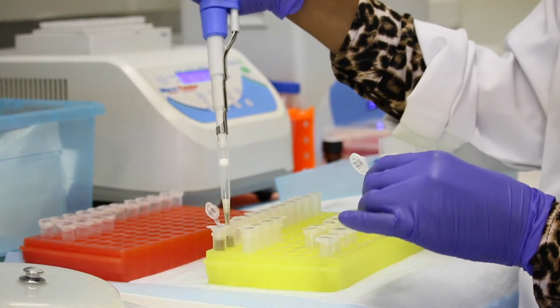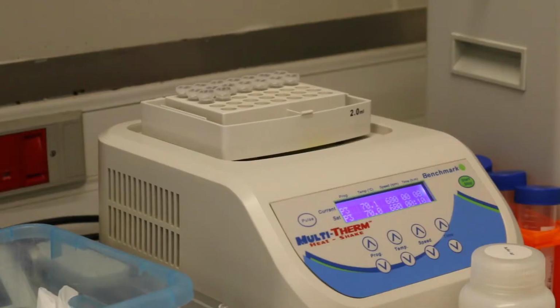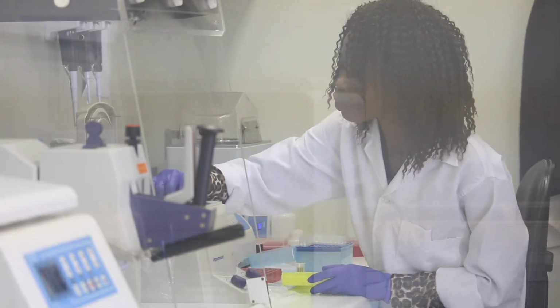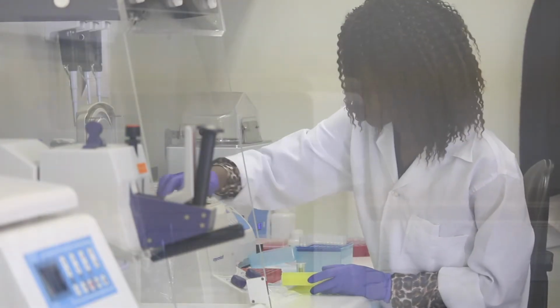We have a laboratory here in Lusaka, Zambia, where we process thousands of samples related to malaria cases, looking for the last cases, aiming towards elimination. And we're using this software to really automate the process by which we can look at large numbers of samples, apply logic to them, and come out with summary data, which we can then visualize in Tableau and understand what's really happening with malaria transmission and dynamics.